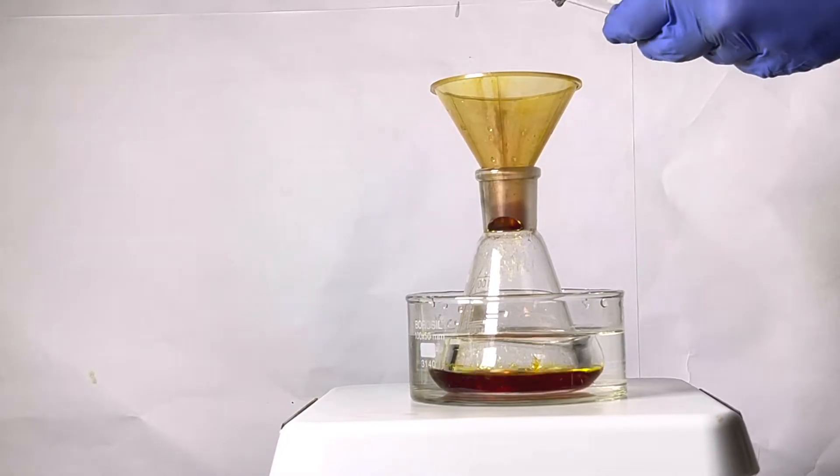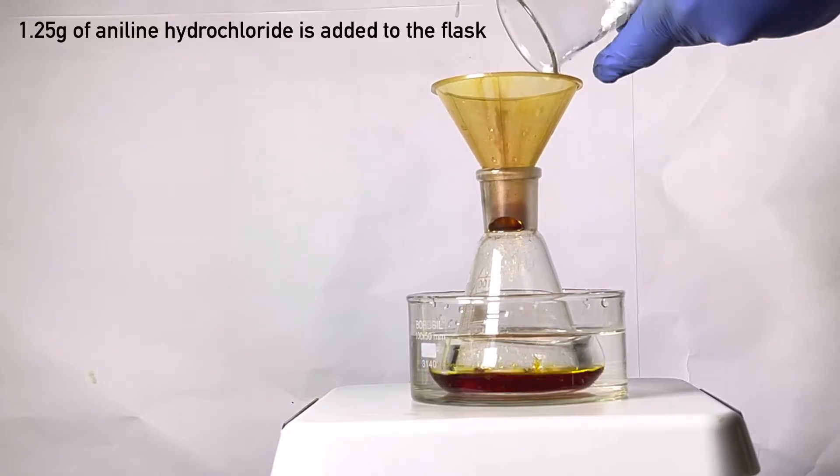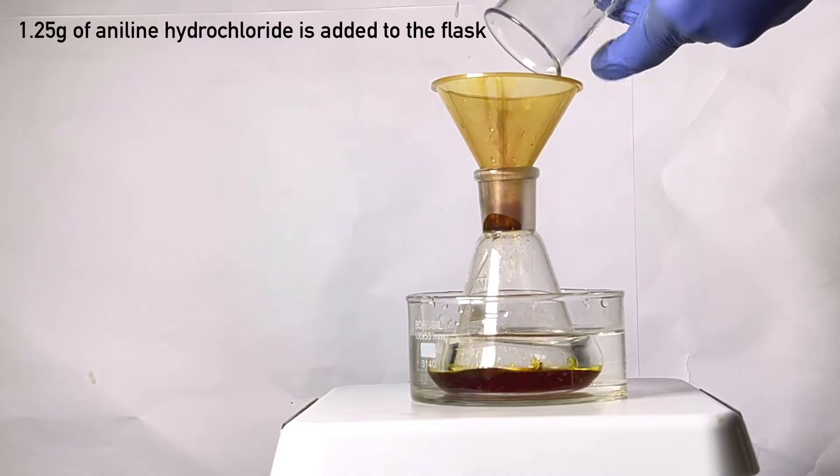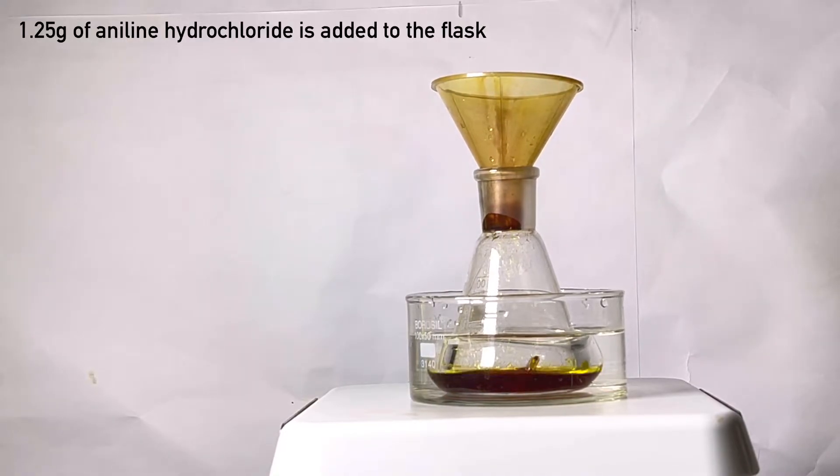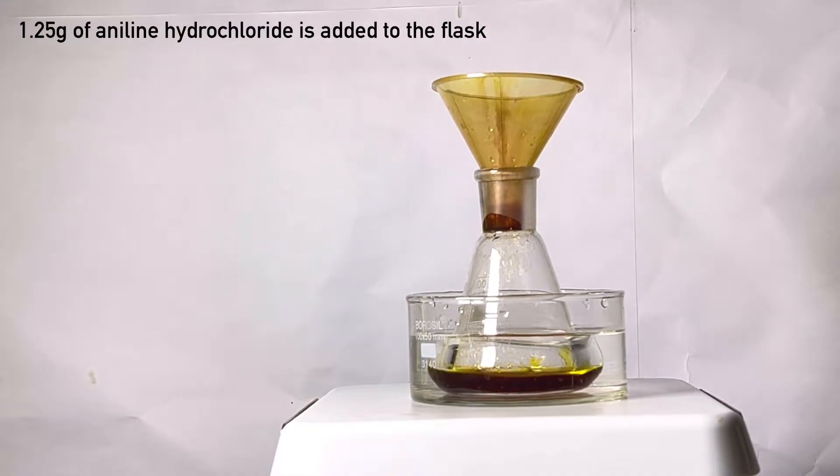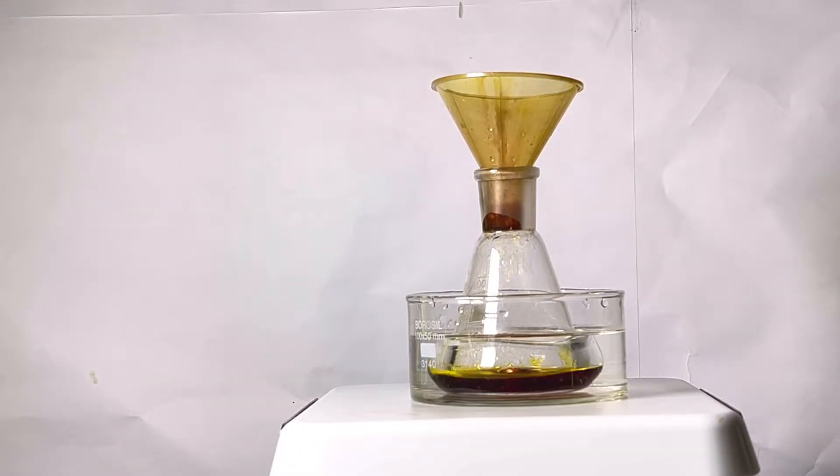Now, with the stirring turned on, 1.25 grams of aniline hydrochloride was added to the flask. It was prepared very easily by adding some aniline to cold, concentrated hydrochloric acid, which immediately precipitates out as white-colored aniline hydrochloride.